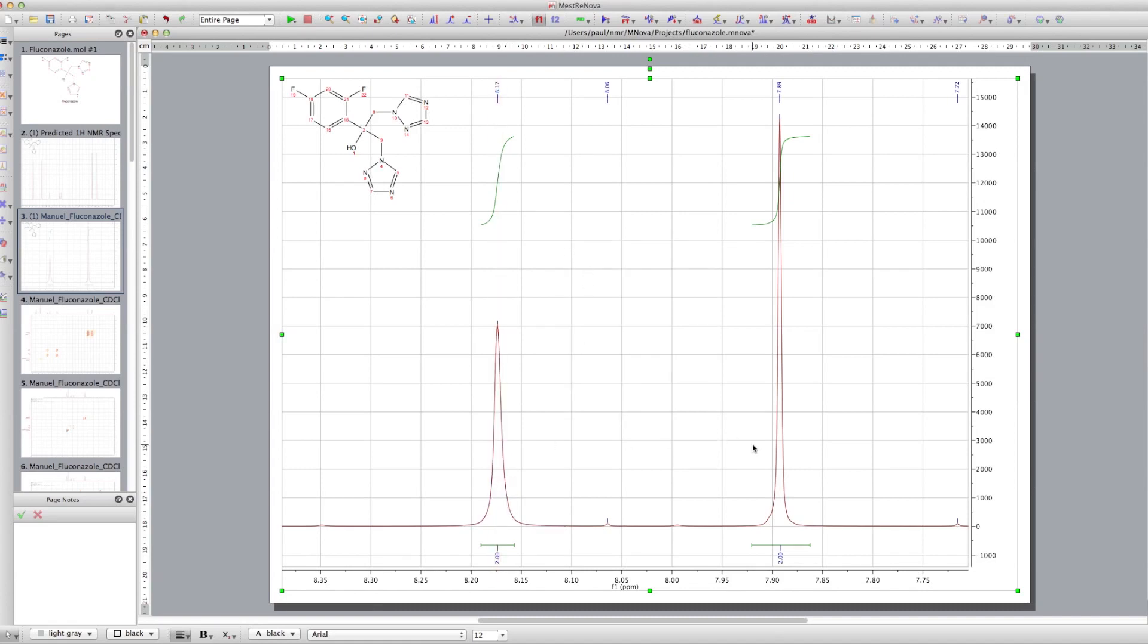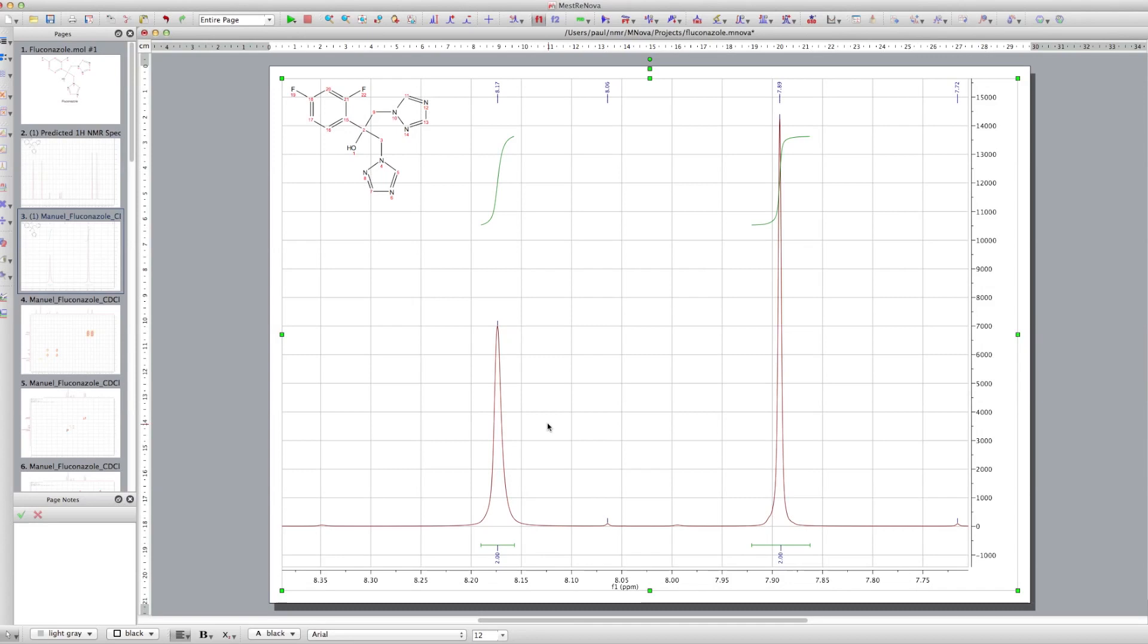So you notice that one's a lot higher than the other. But if you integrate them, they actually integrate the same. And it's just because one is actually relaxing slightly different to the other one, and it's broadening the peak of the other one.